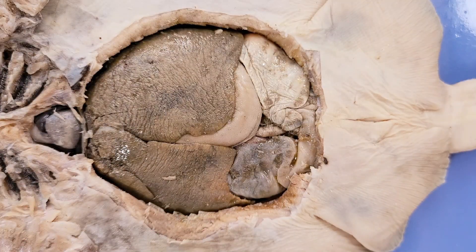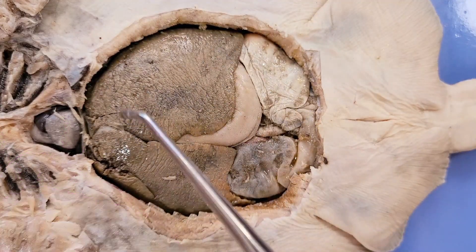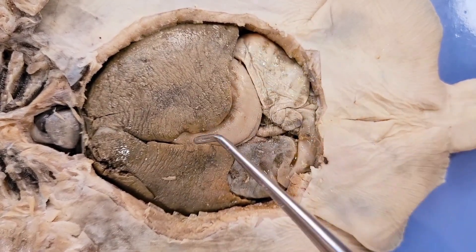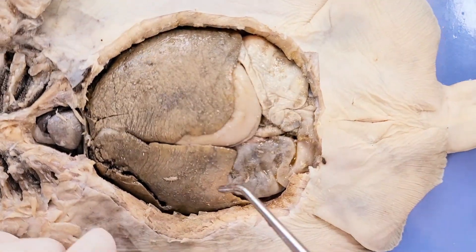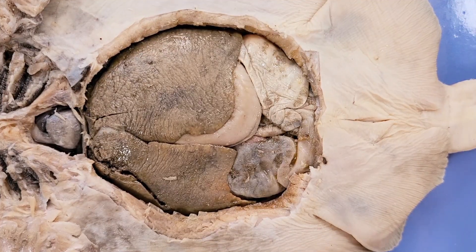The first thing we see here is this large liver — this whole brown structure. It has three lobes: one, two right here, and the third one in the corner here. Like most animals, a skate's liver helps clean the blood, filter waste, and store energy.